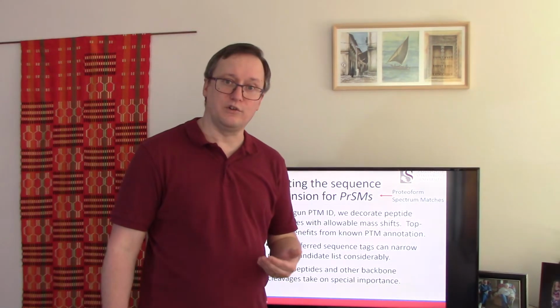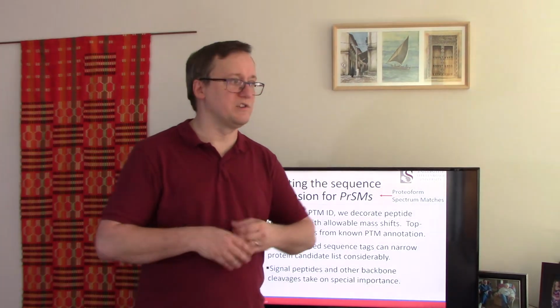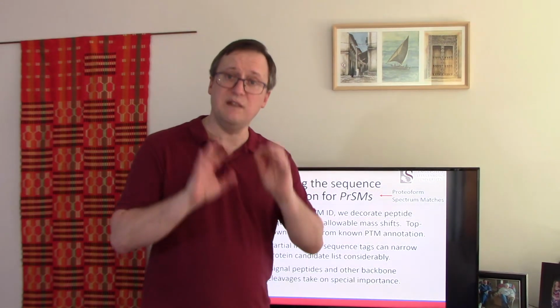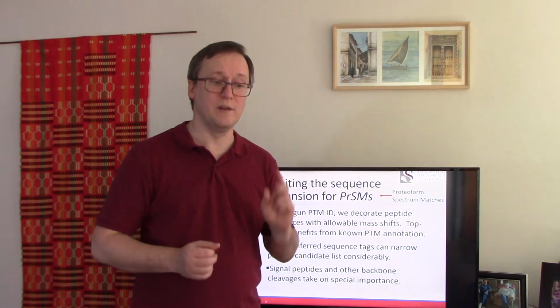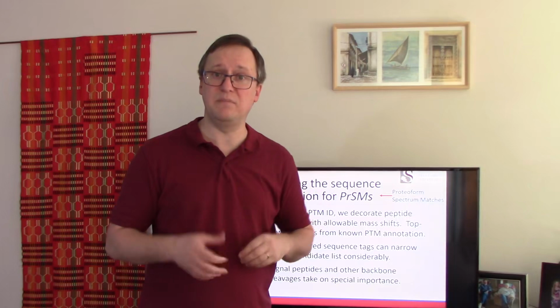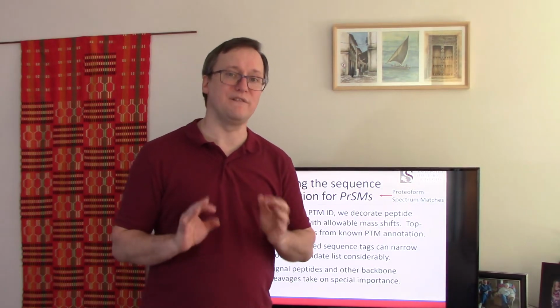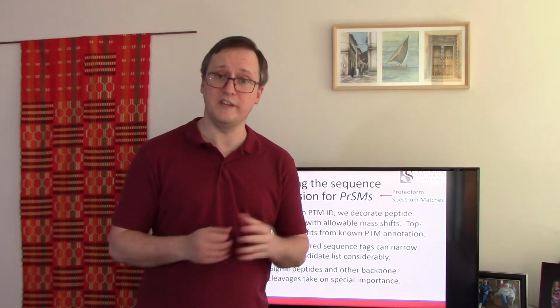In database search for FASTA sequence databases, most of our tools like Sequest and so on typically say any methionine may be oxidized. And if you set up for a phospho search, any serine, any threonine, any tyrosine may be phosphorylated. That's great. But in fact, we have a fair bit of knowledge about known post-translational modifications on these sequences.